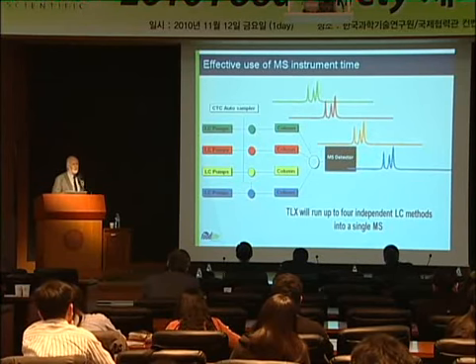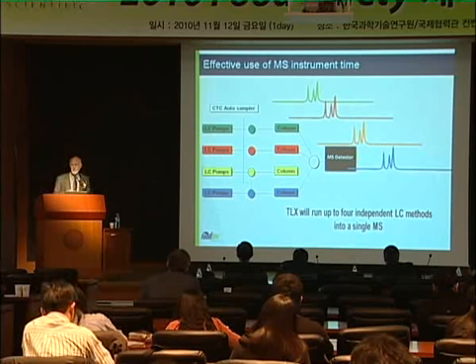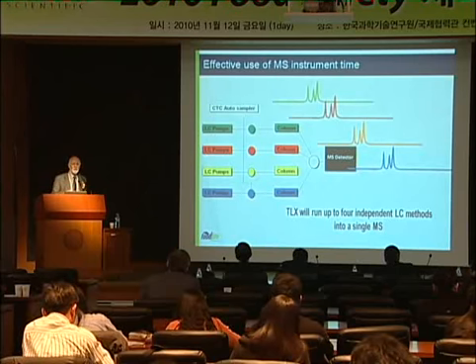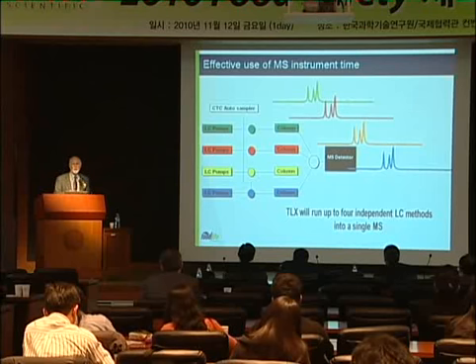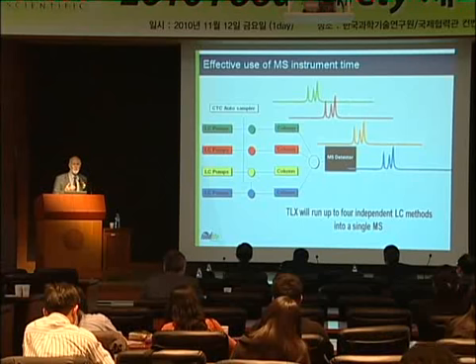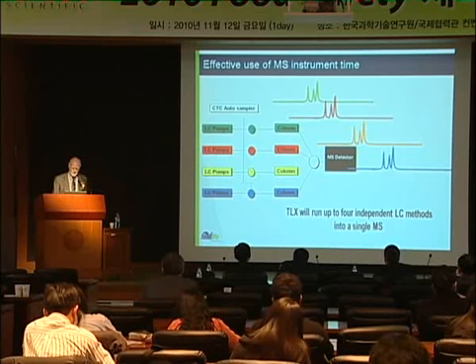So you can see in this example, by using a very simple column switching technique, we're analysing 4 times as many samples with the mass spectrometer as we would if we had a single HPLC system coupled through. This is only cost effective, again, if you have large numbers of samples to analyse, but in many of the food safety programs, you do have large numbers of samples. You can increase productivity here by a factor of 4 using this column switching technique.